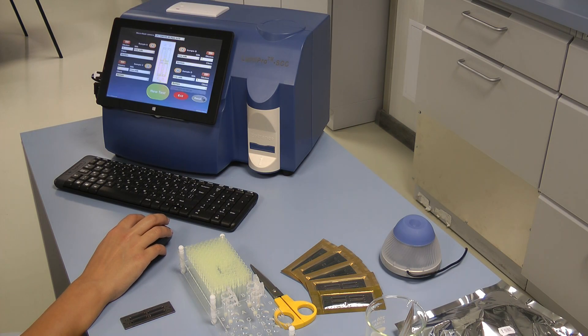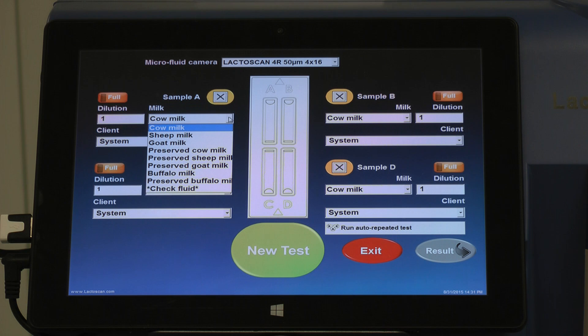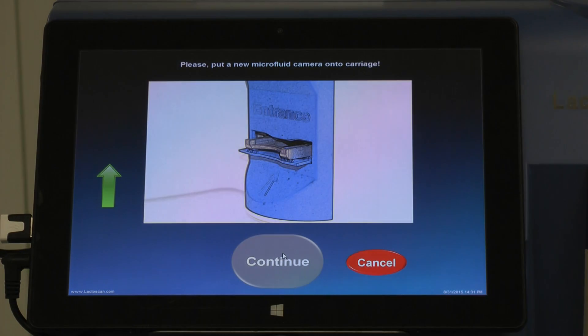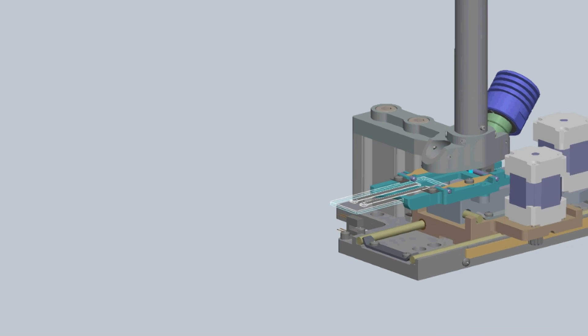Press Start on the main screen, then choose the type of chip from the drop-down menu. Choose the type of milk from the drop-down menu. Then enter the name of the supplier or choose from the drop-down menu. After entering all the information, press New Test to proceed with the analysis. On the screen, a message will be displayed showing that the carriage for placing the LactoChip comes out of the door. Place the LactoChip into the carriage and press Continue. The device is now making the analysis of the samples.